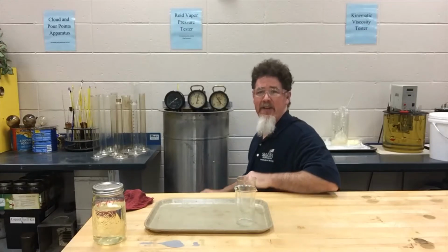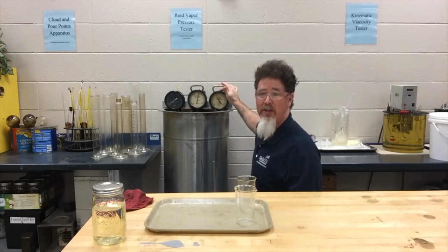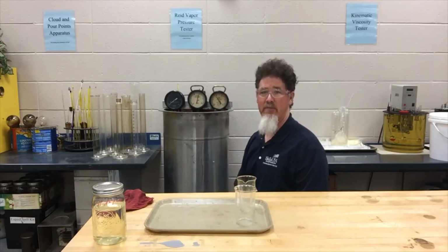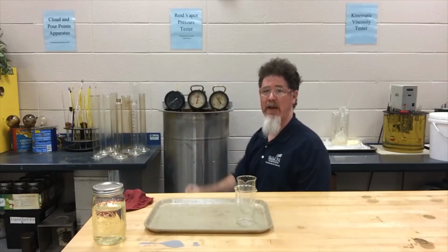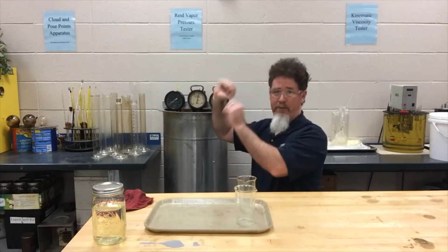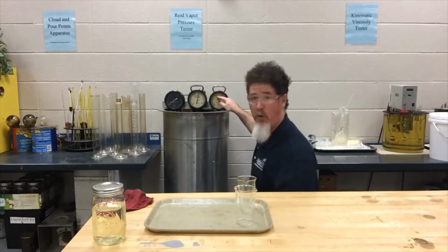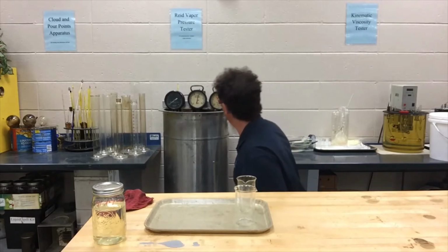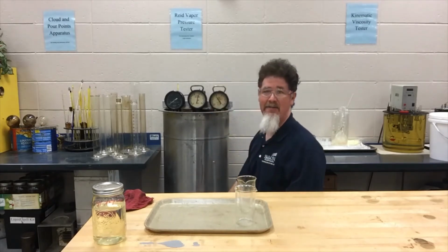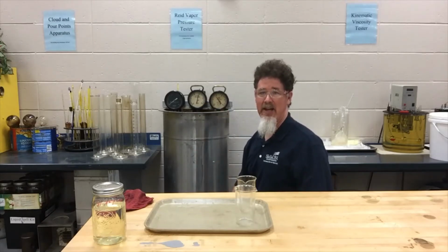We're back, and if you take a look at the gauge readings, the 87 octane that started out originally at 13.6 Reid vapor pressure, I opened up the canister, let the vapors escape, screwed it back in, heated it back up, put it in the test bath, shook it up a few times, so it's been in there for 10, 15 minutes. It stopped climbing for a while. It's been sitting here for a while. It hasn't moved. We're at about 5.5 Reid vapor pressure. So that was just opening up that container one time, and the vapors escaped. And once those vapors escaped, they don't come back.